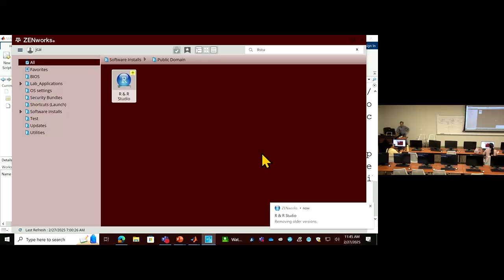Basically, it will update the R environment on your machine and make it ready. Then we can link to this newly installed R environment from MATLAB, so we can use the package in the drop-down menu over there.